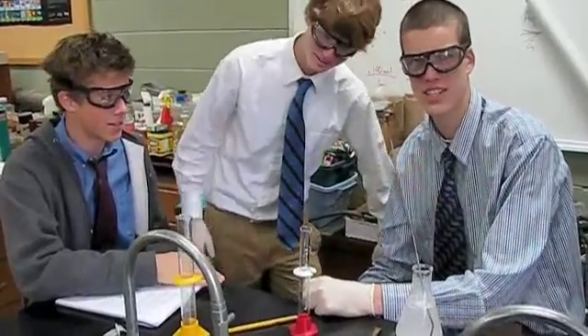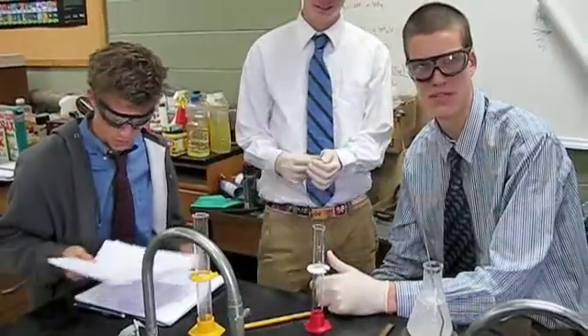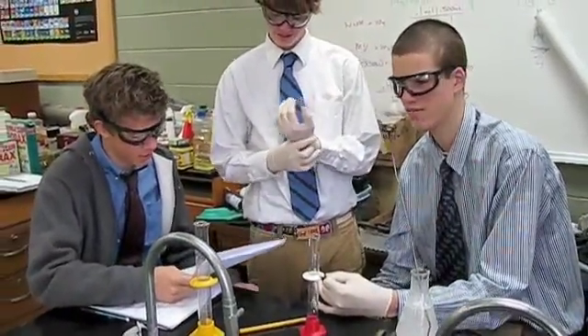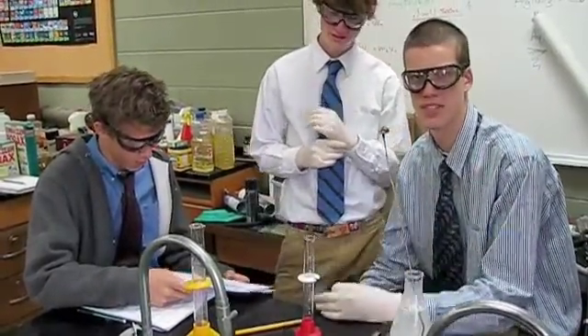What are you doing, guys? We're doing titration of vitamin C. So basically we're just taking random stuff you eat every day — spinach leaves, sour patch kids, vitamin C tablets — and finding out really how much vitamin C is in it.